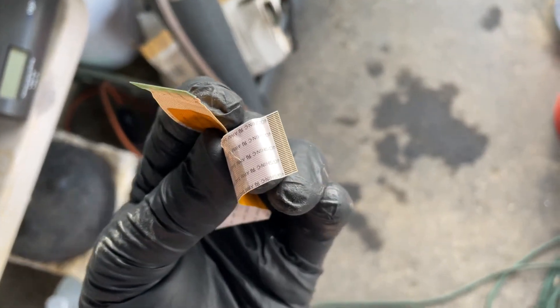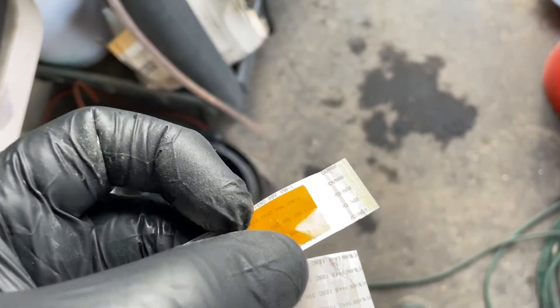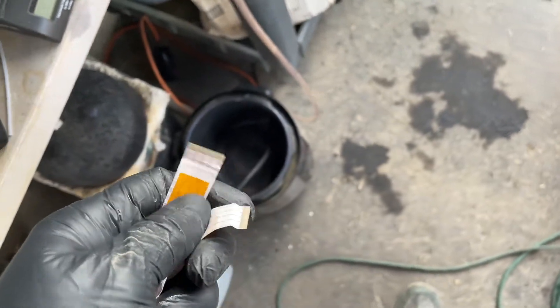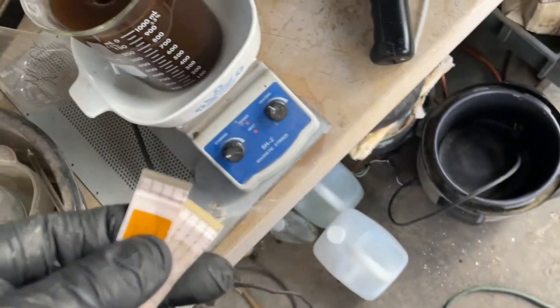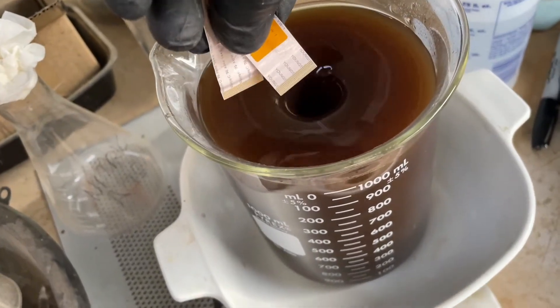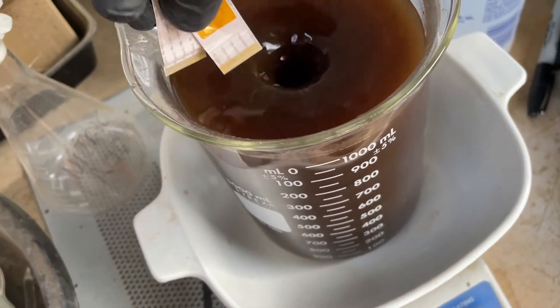Yeah, these things have just like a micro coating of gold. You can see it. Anyway, I'm going to try a preliminary test here right now. I'm just going to get these dudes in there.